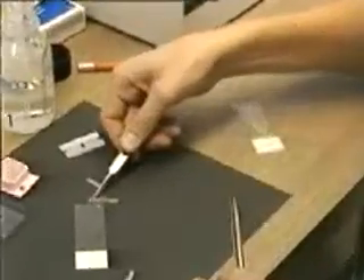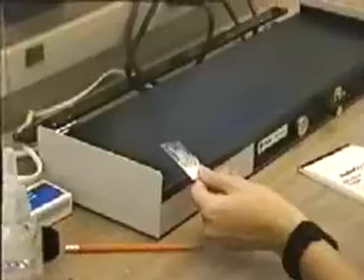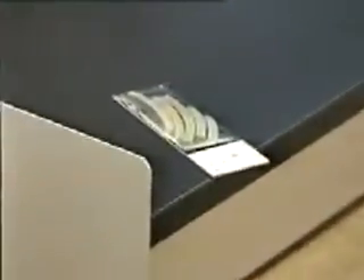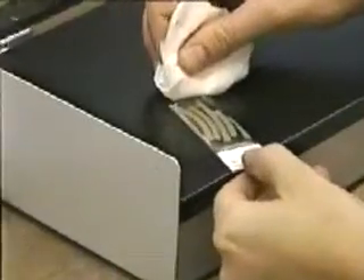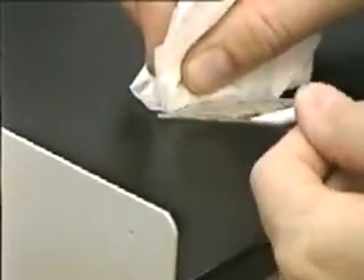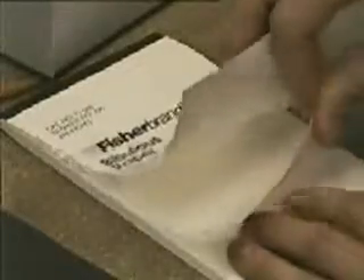The ribbons of sections can be placed in a particular order so that serial sections can be traced. The slide is then placed on a warming table to evaporate some of the fluid and to help the sections adhere to the glass. After a period of time, the excess fluid can be blotted off with a tissue. Additional blotting is performed using a bibulous paper that absorbs like filter paper.